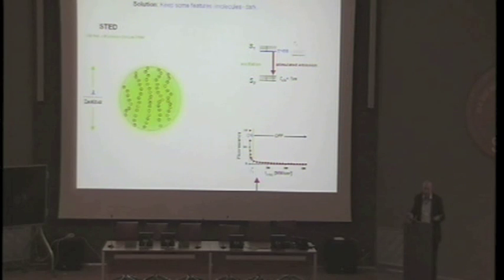Of course, you have to make sure that there is a red photon at the molecule in the case the molecule is excited. And that condition is fulfilled by making sure that the red beam is bright enough. If there's enough intensity of the red beam, then you can be sure there's always a red photon there that gets the molecule down in the case the molecule gets excited. So these are the two conditions.